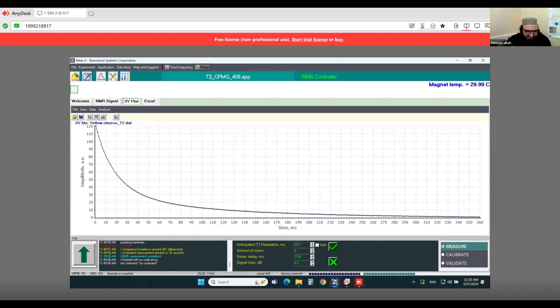Now the first step I will take is to ask my colleagues to change to the next sample. We have two more samples which are very interesting, pure chocolate. We have taken the example of pure chocolate, one of them is cocoa 60%, 70%, and the main concentration of the second one is 61%. So I will ask my colleague to change the sample and put in the 70%.